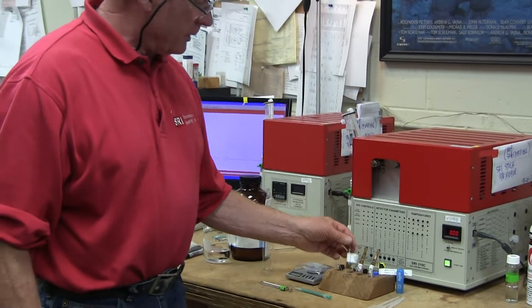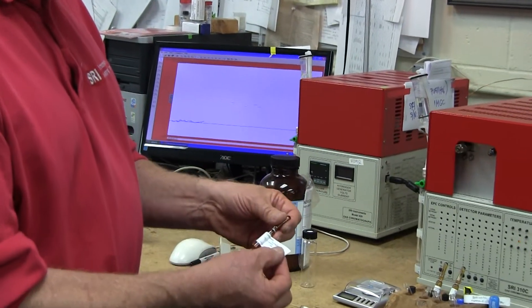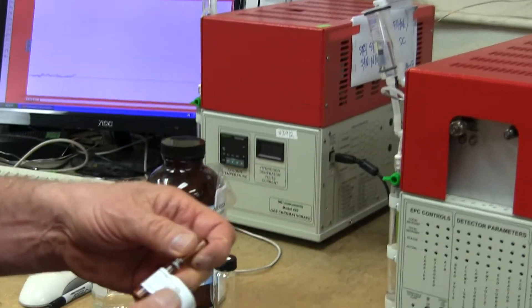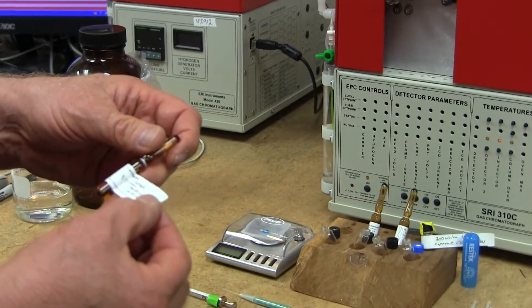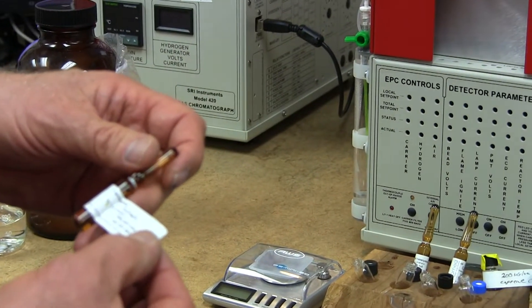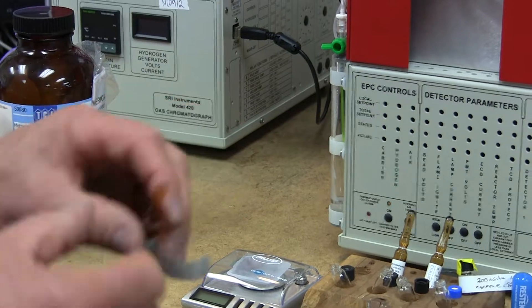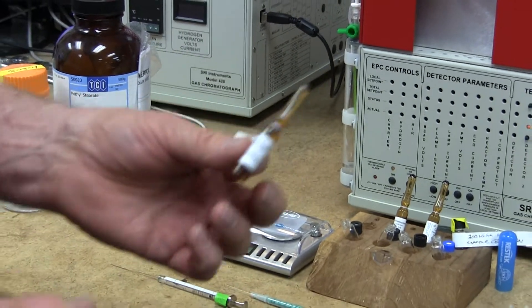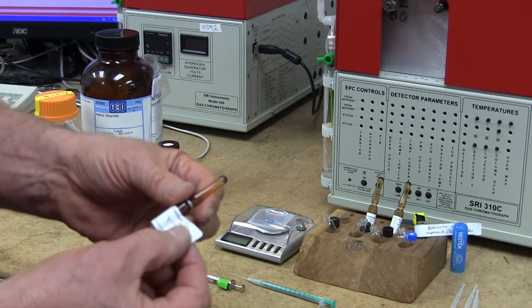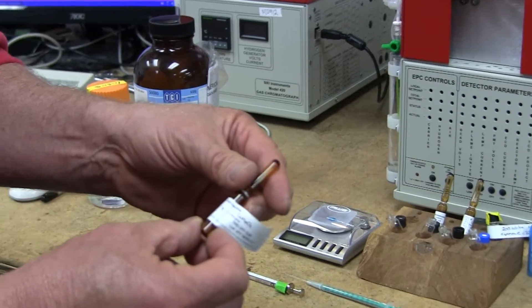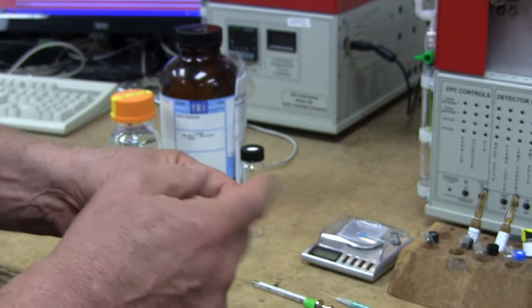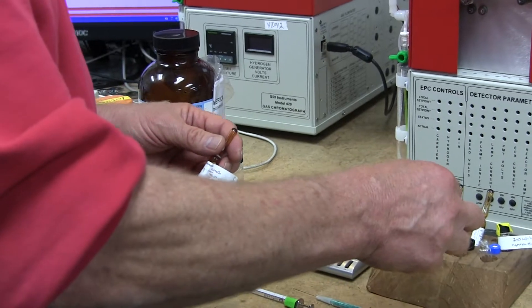So to start with, you need to purchase from one of several companies a calibration standard for CBD, THC, and CBN. So this is what they look like. They come in a little ampule like this, costs about $25, and this contains a tenth of a percent CBD and we're going to put that into a separate little bottle. These are called one and a half or sometimes two milliliter bottles.